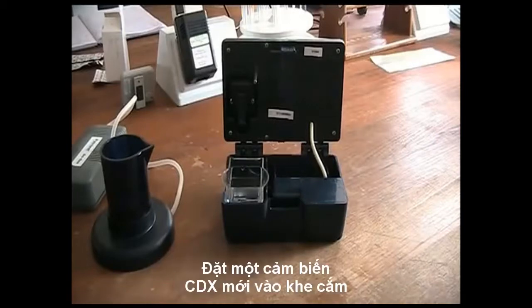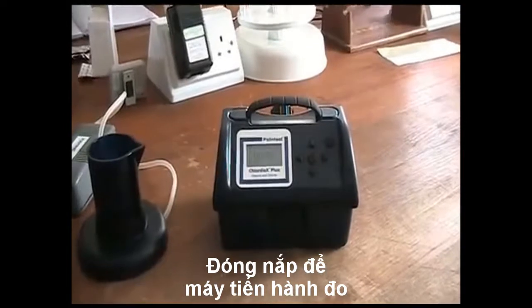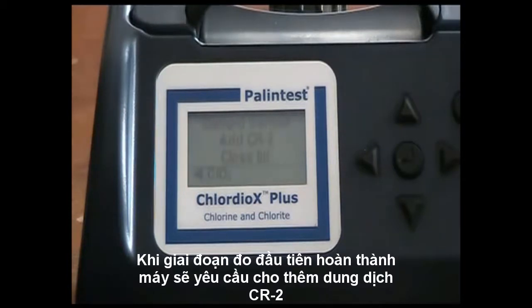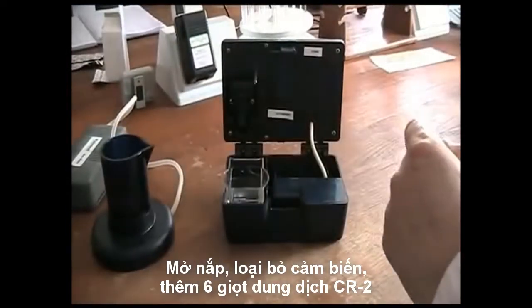Insert a fresh CDX electrode and close the lid. The measurement time is 1 minute. Once the first measurement phase is complete, the screen will guide you to add CR2 reagent. Open the lid, remove and discard the sensor, but retain the sample.